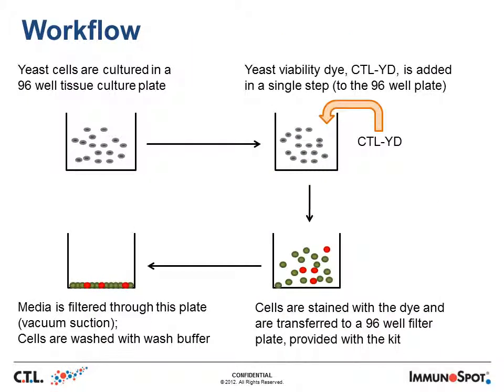The workflow that we have has been developed to be extremely simple. We start off with cells that are being incubated in a 96-well plate with whatever drug of choice as per your protocol. Now, this need not be a 96-well plate. It could be any reactive format. Here we mention 96-well plates as transfer of samples can then be performed with a robot or a multi-channel pipette.